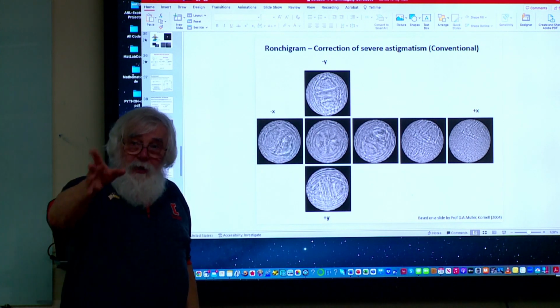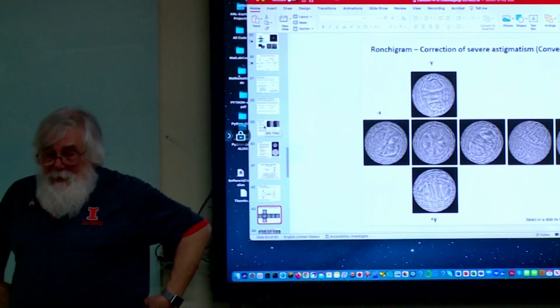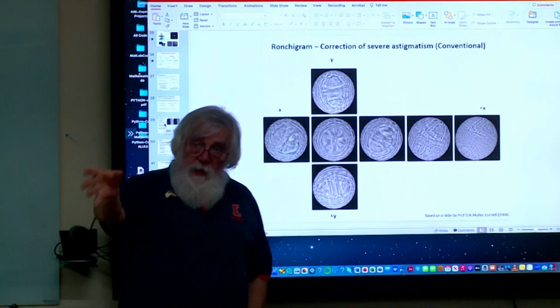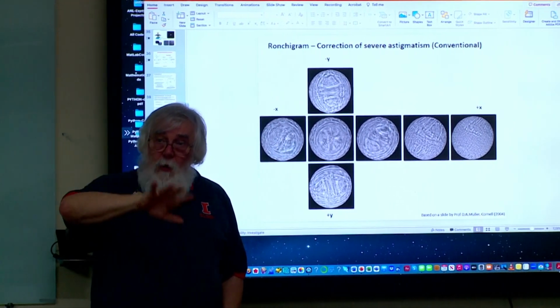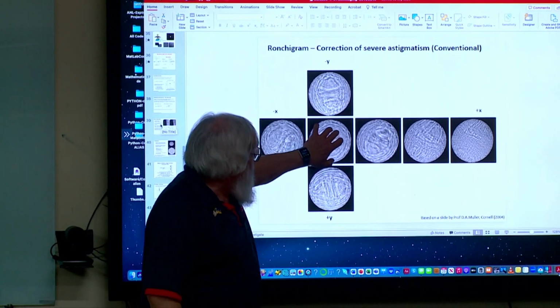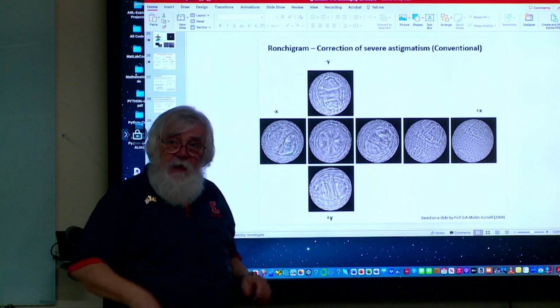Now, what you asked is, that's for an amorphous sample. How do I do it in a crystalline sample? What you have to do, and this is something you're going to have to learn how to do, as you go through focus, whether it's a crystalline material or an amorphous material, you will still see this thing expanding and decreasing its size.